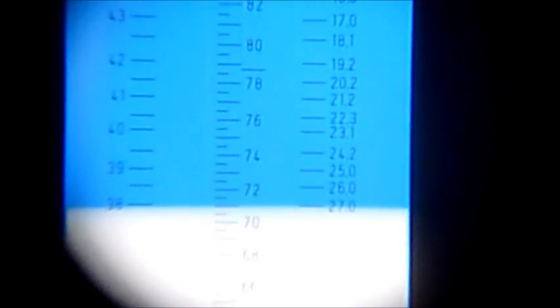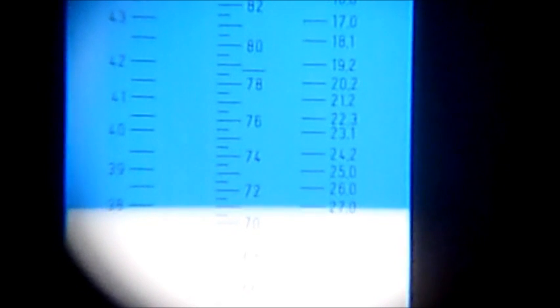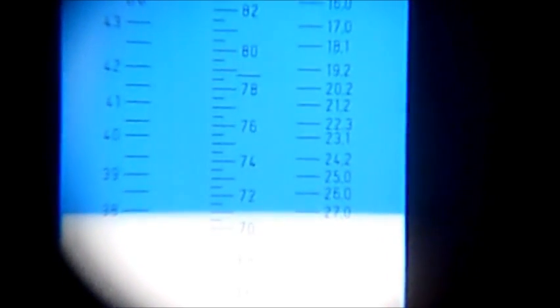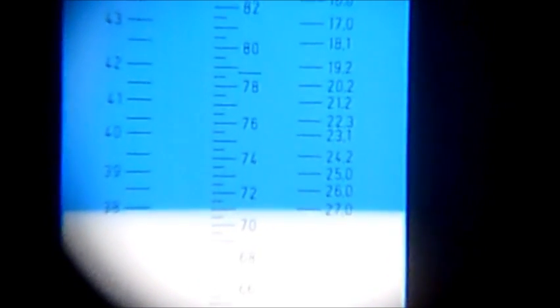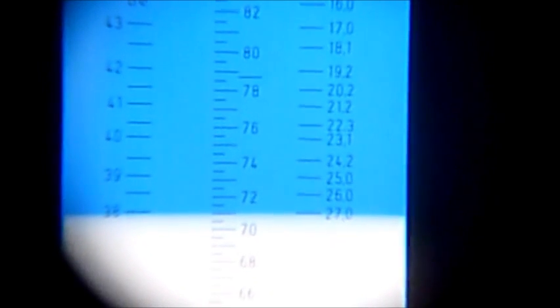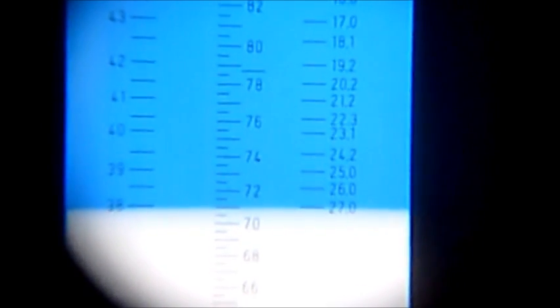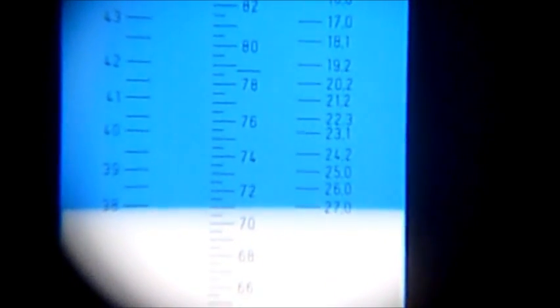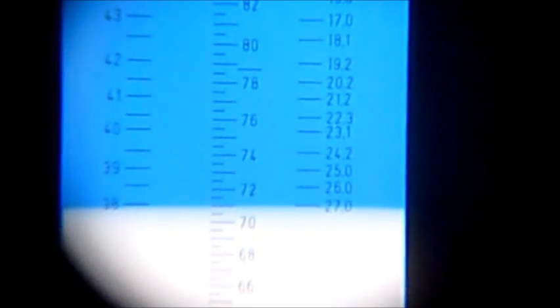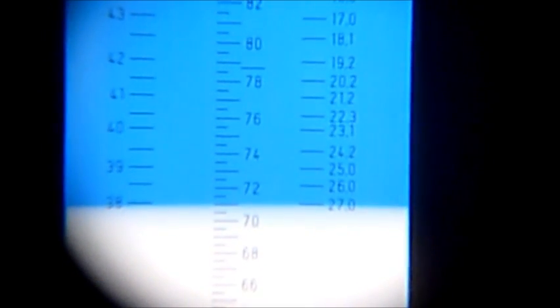The refractometer is reading just on 71. So that's exactly the same as it was when I bought this one a year or so ago. And that means it's still, as far as I'm concerned, in calibration. I don't need to make any adjustments.